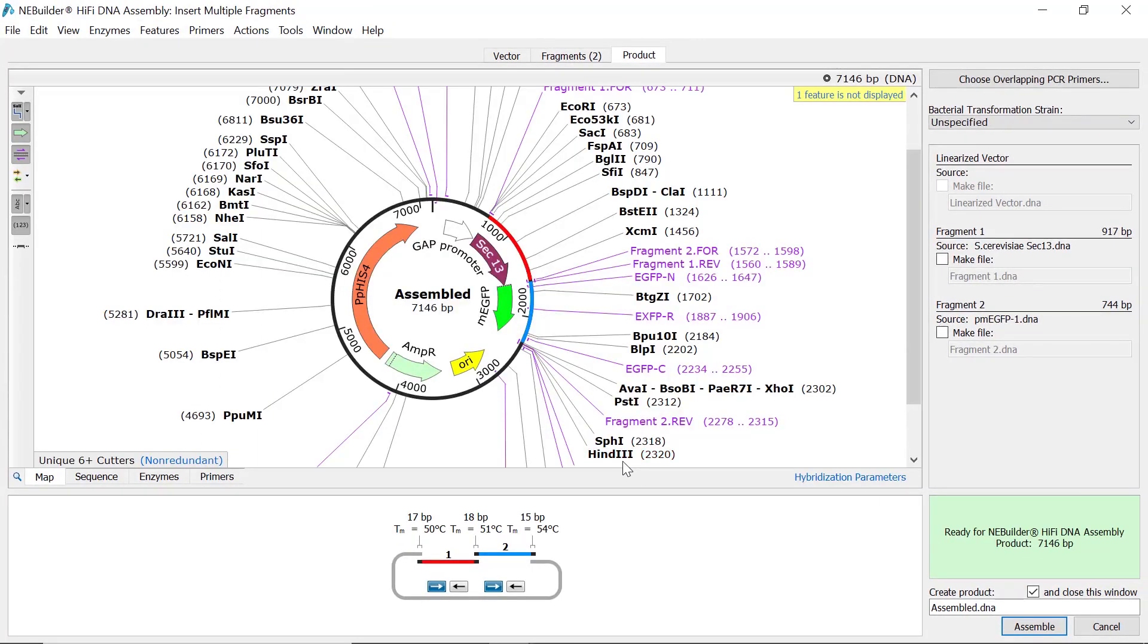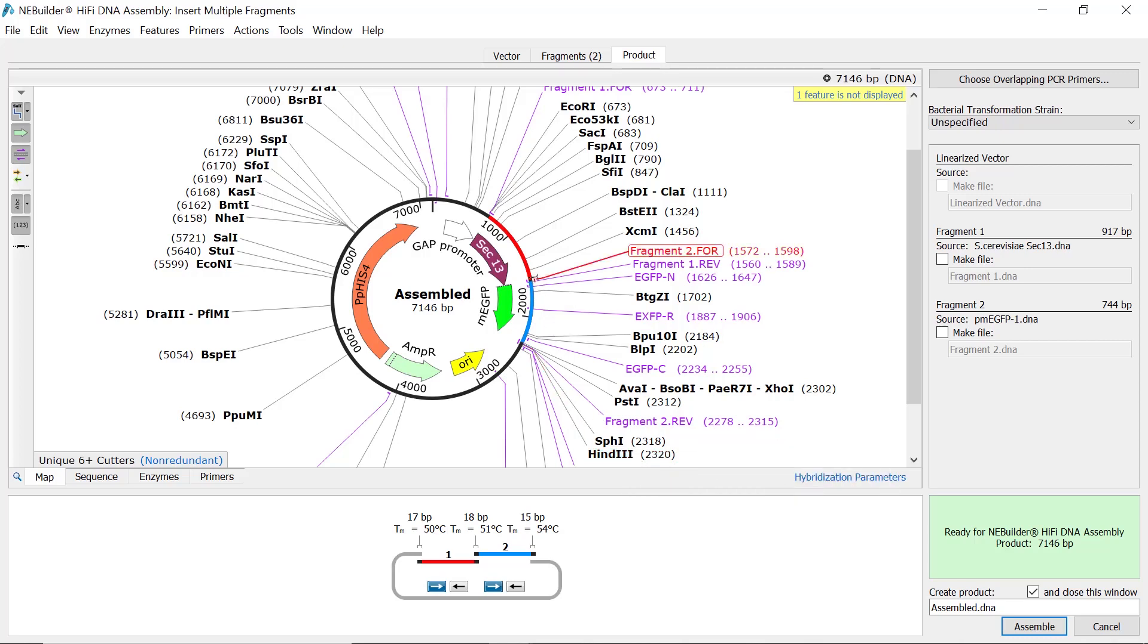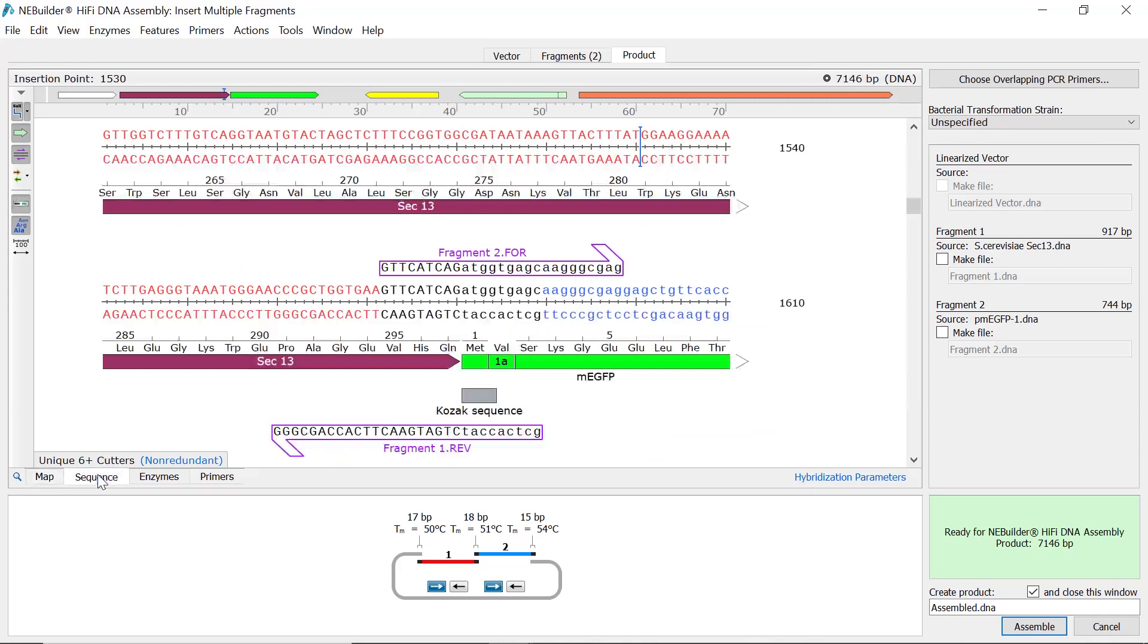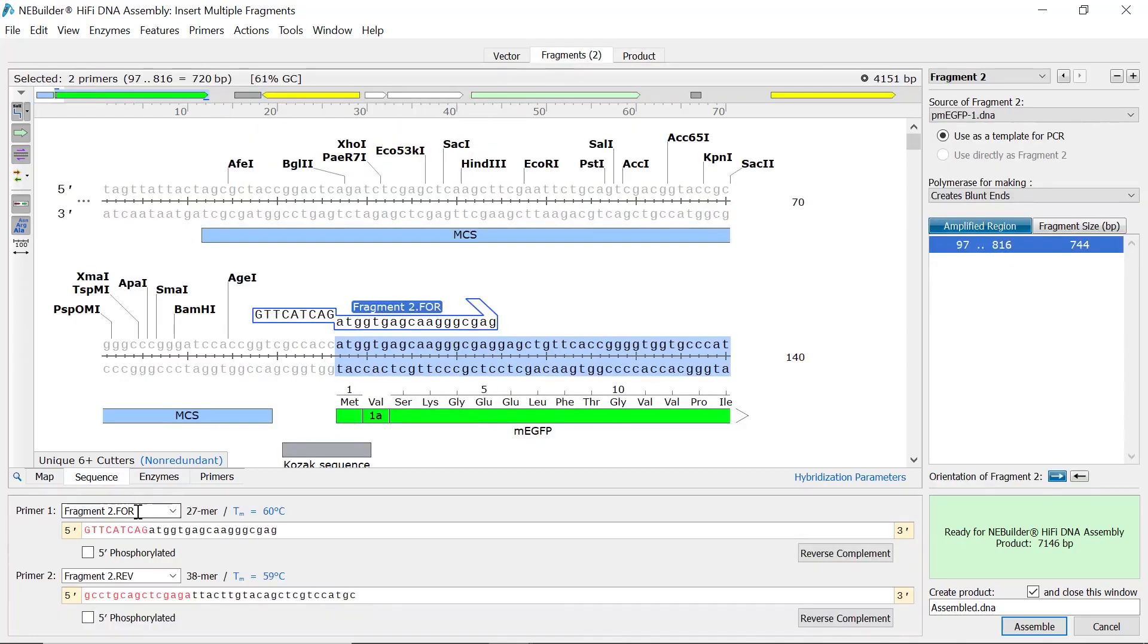The resulting NEBuilder HiFi assembly product can now be previewed, and by switching to the sequence view you can assess the fusion boundaries and primer sequences. You can also switch to the fragments or vector tabs to rename the newly designed primers.